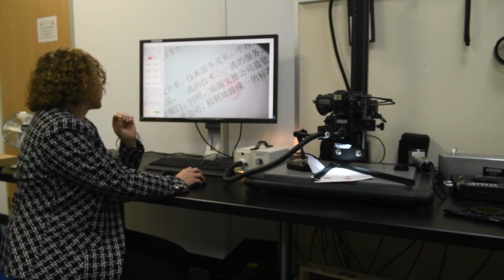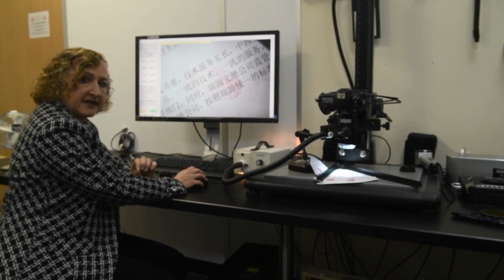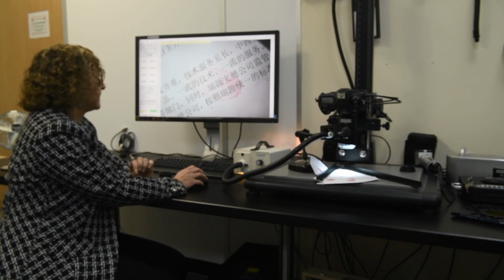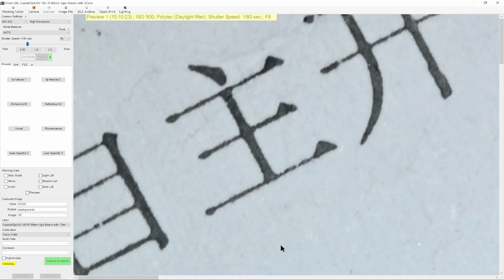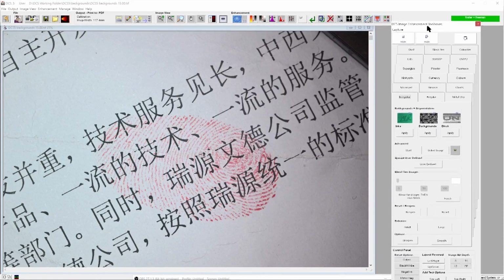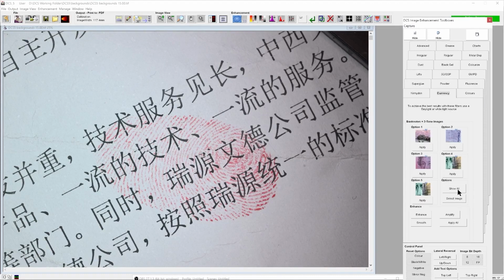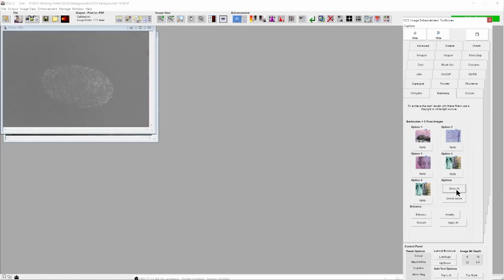So we're now going to capture our image, and then we're going to enhance it using those colour subtraction models we were talking about. So the image is captured in colour, and using the colour information in the software module that we have here, we're going to select an option to give us 5 different colour models.